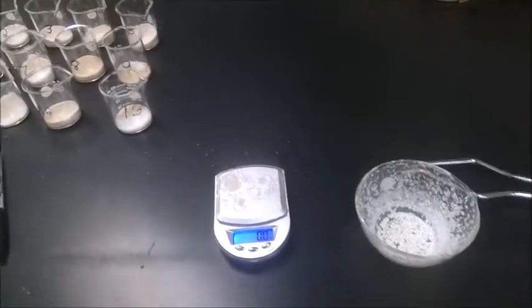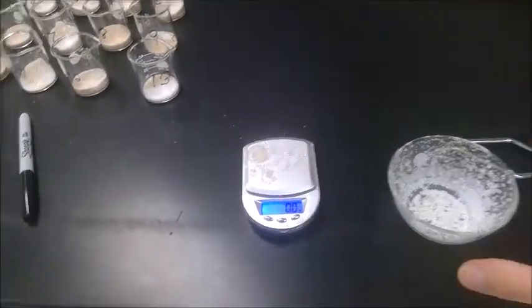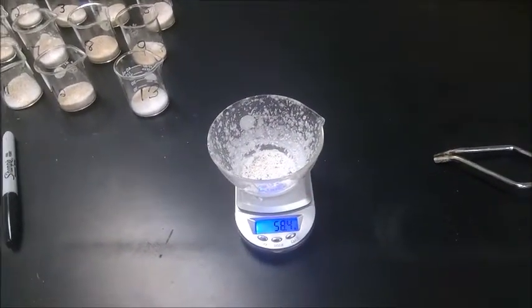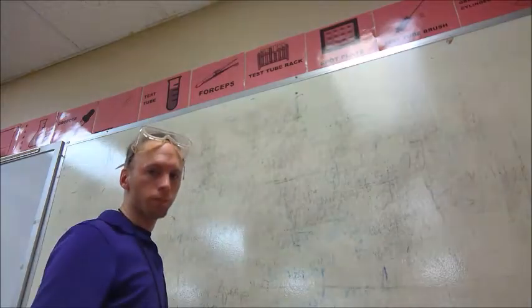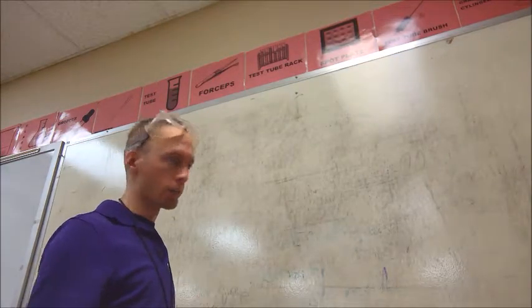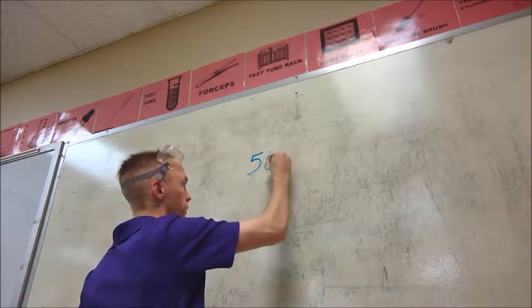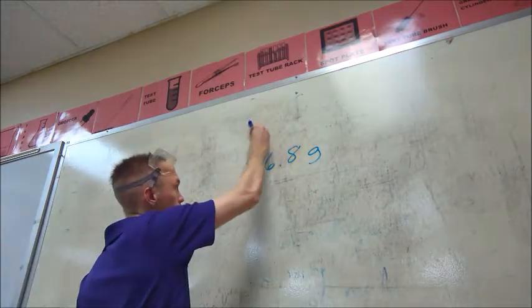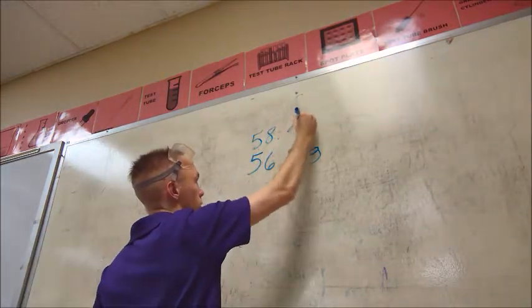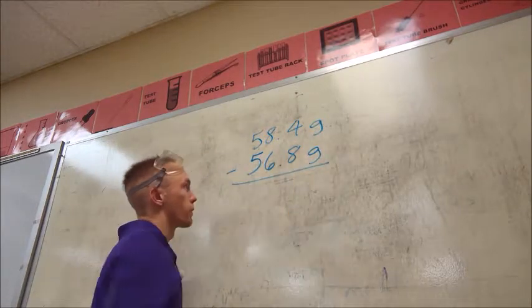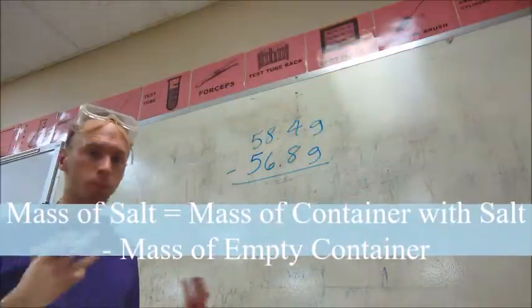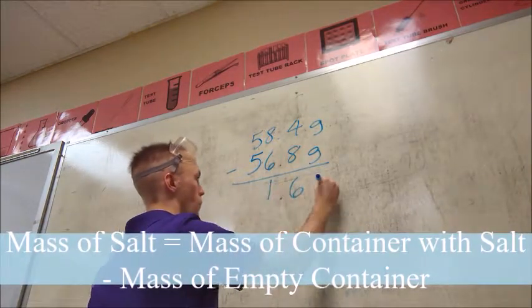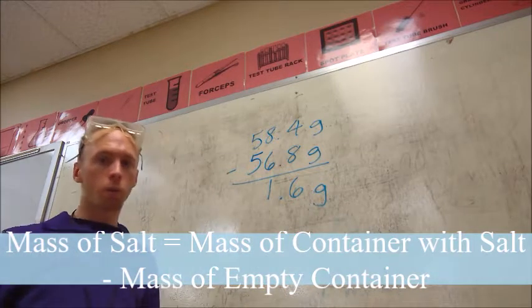I have my finished separation process here with my salt and I'm going to put it on my digital scale and weigh, 58.4. The mass of that glass container I used was 56.8 grams and the final mass I measured was 58.4. I'm going to subtract those two masses to get the mass of my salt. 1.6 grams. Let's see how that stacks up.